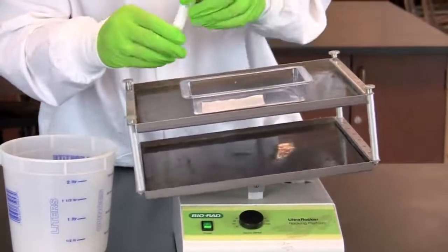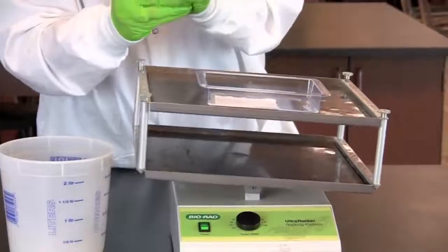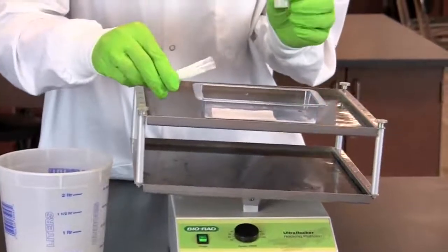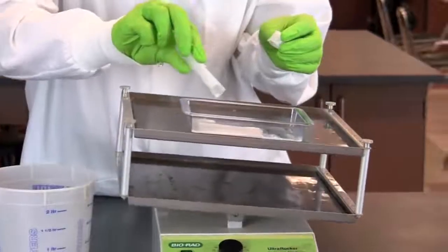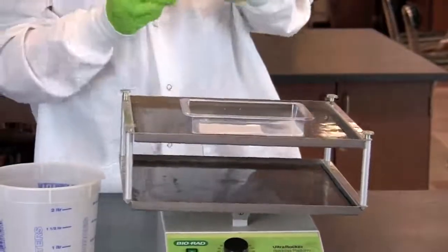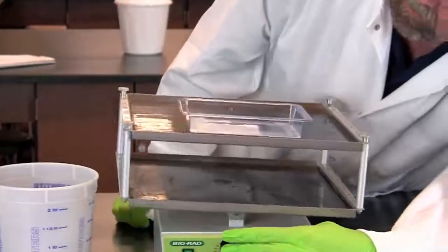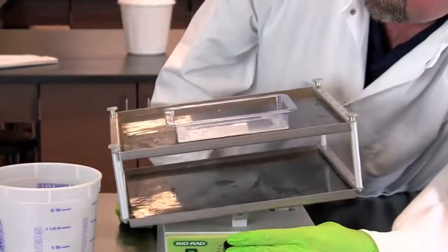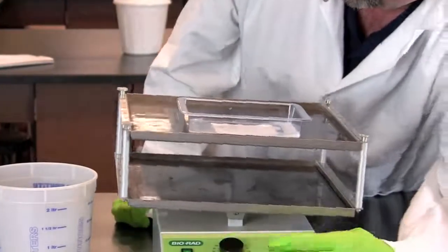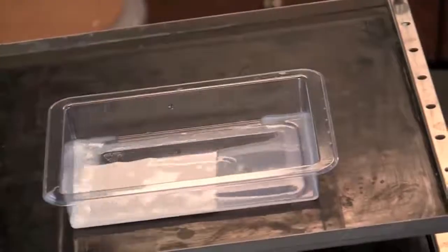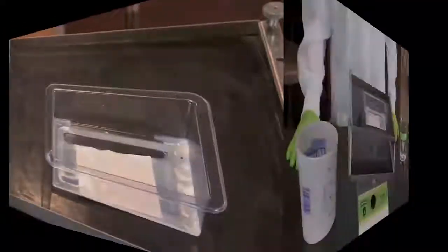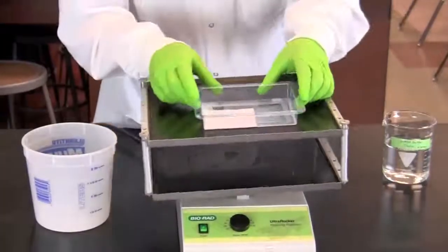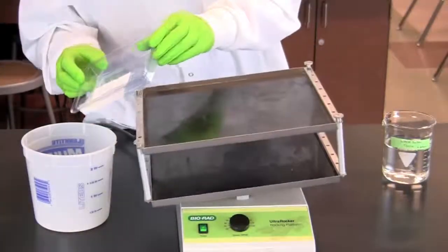Add 10 milliliters of primary antibody. Incubate for 10 to 20 minutes on a rocking platform. The platform should be set at a faster setting to ensure constant coverage of the membrane. Pour off the primary antibody.